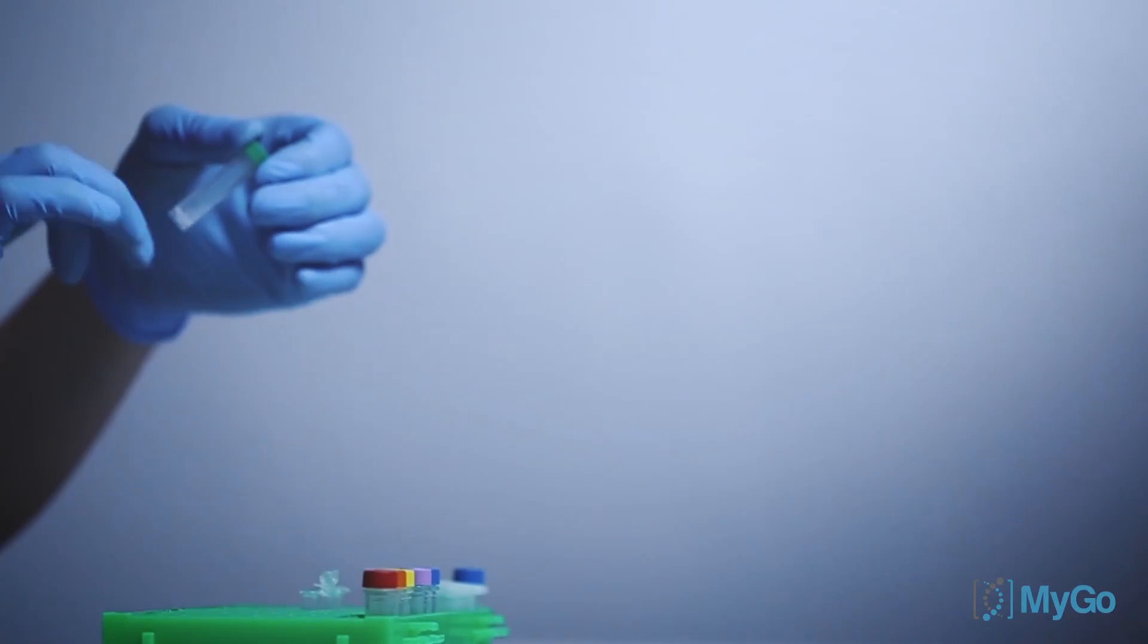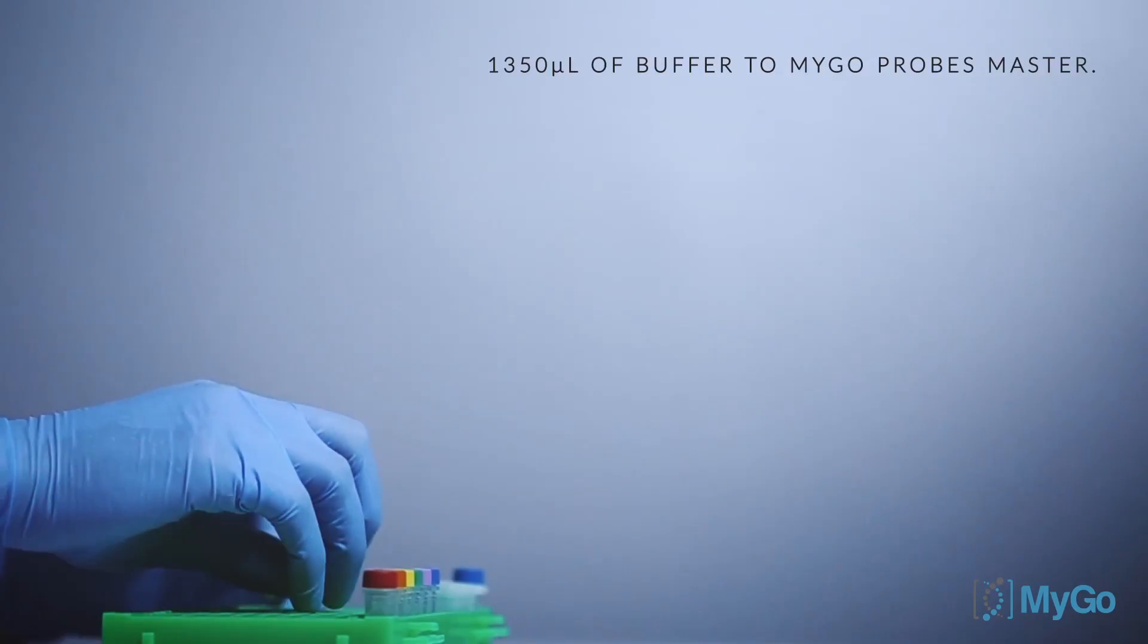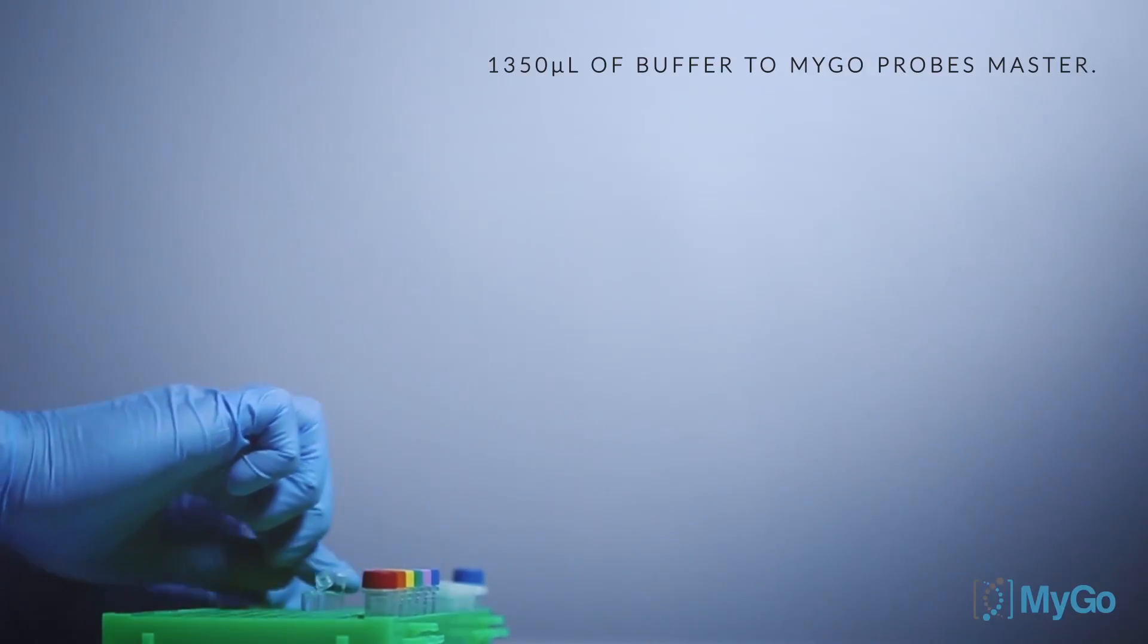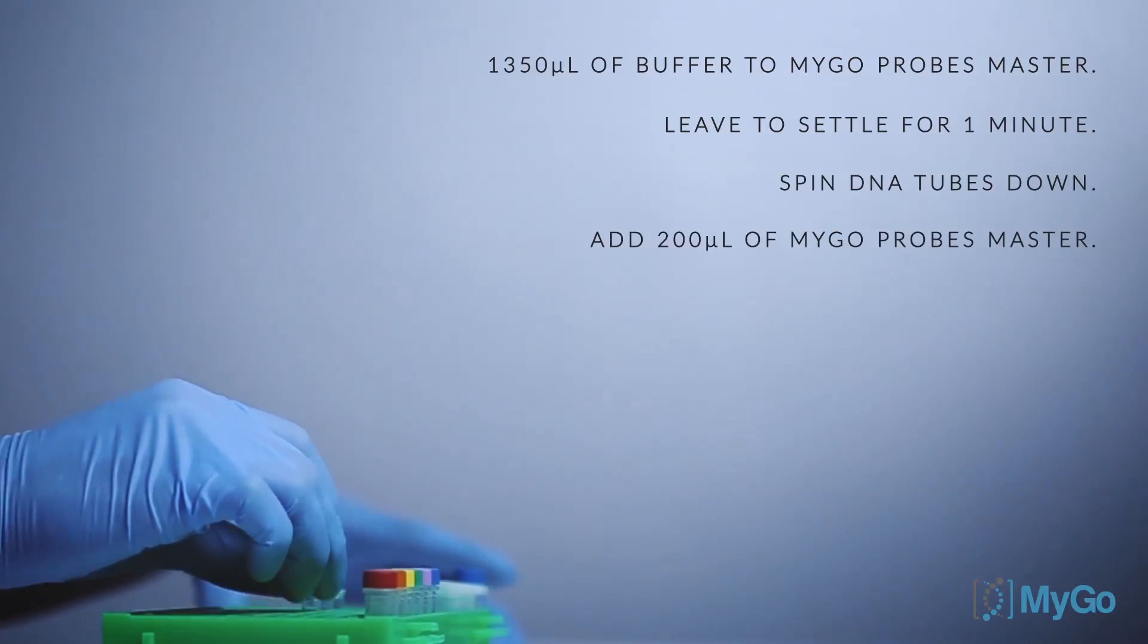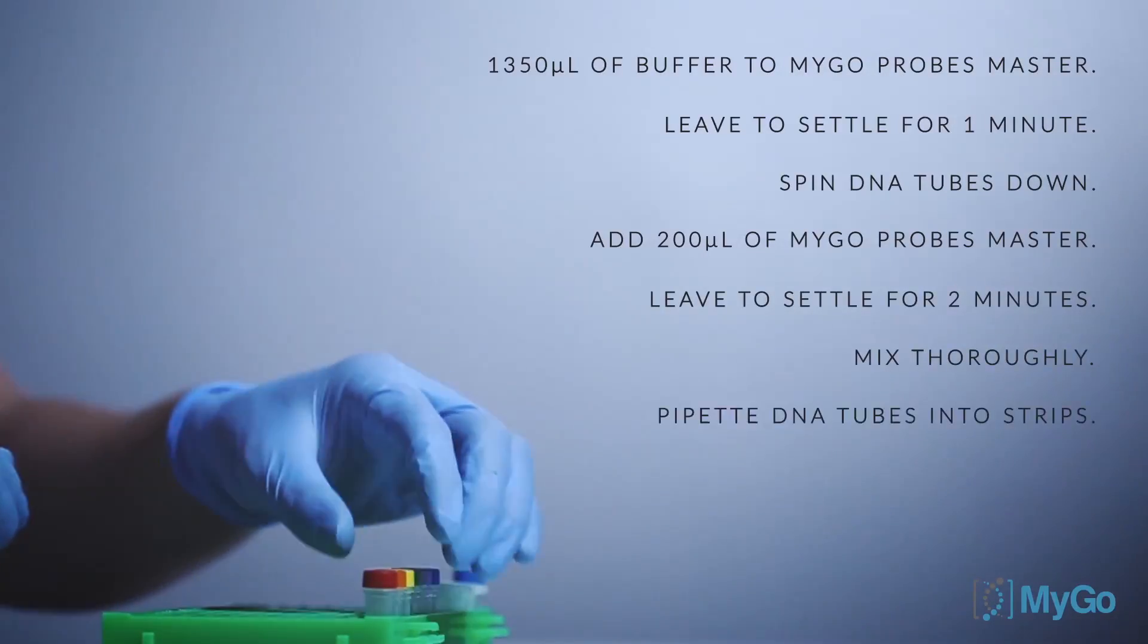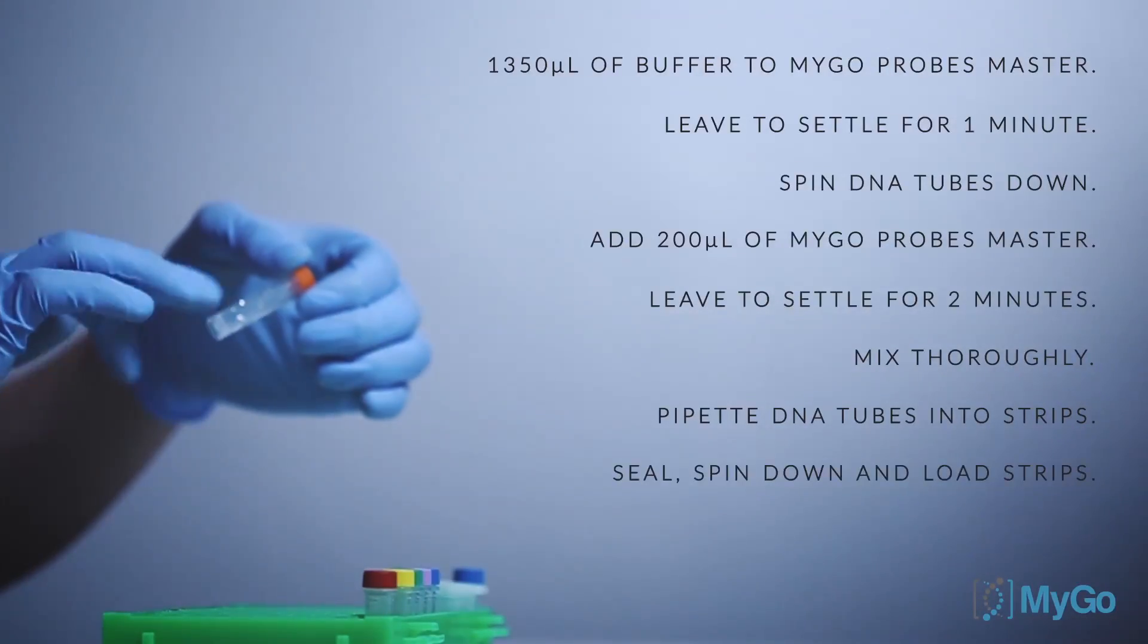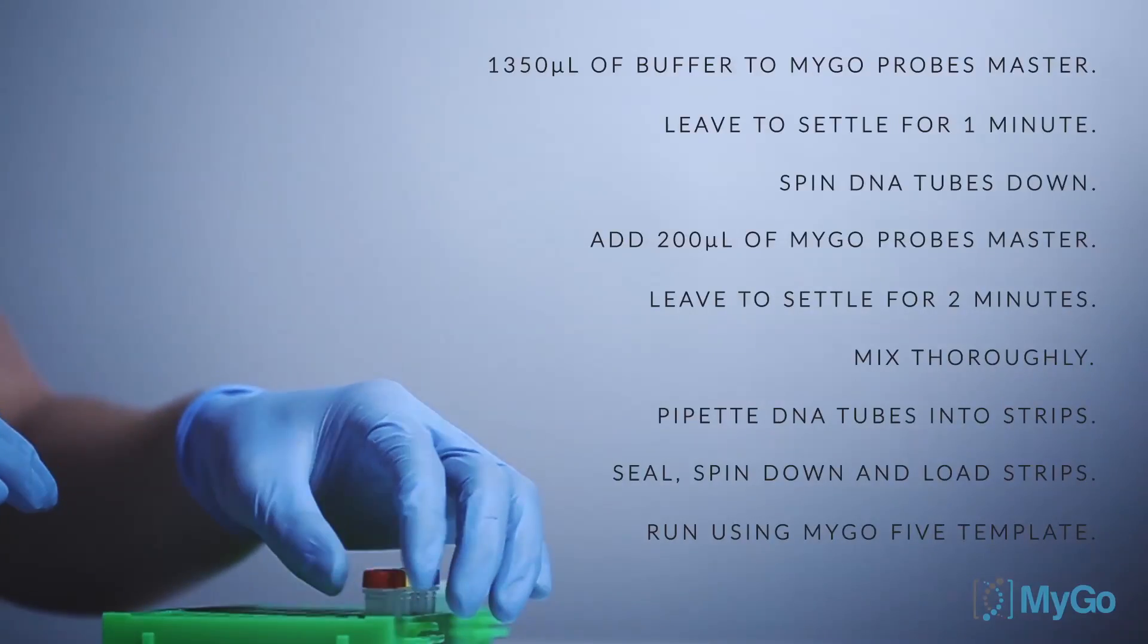To summarize, the MYGO5 reaction preparation procedure involves the following steps. Add 1,350 microliters of buffer to the vial of MYGO Probe's master and leave it to settle for one minute. Spin DNA tubes down and then add 200 microliters of MYGO Probe's master. Leave to settle for two minutes, then mix thoroughly. Pipette DNA tube contents into MYGO 8-well strips, seal the strips, then spin down the strips and load them into the MYGO Pro. Start the run using the MYGO5 software template.